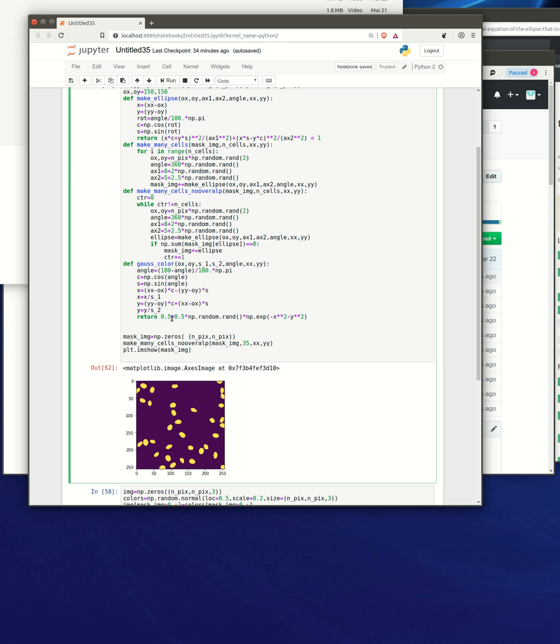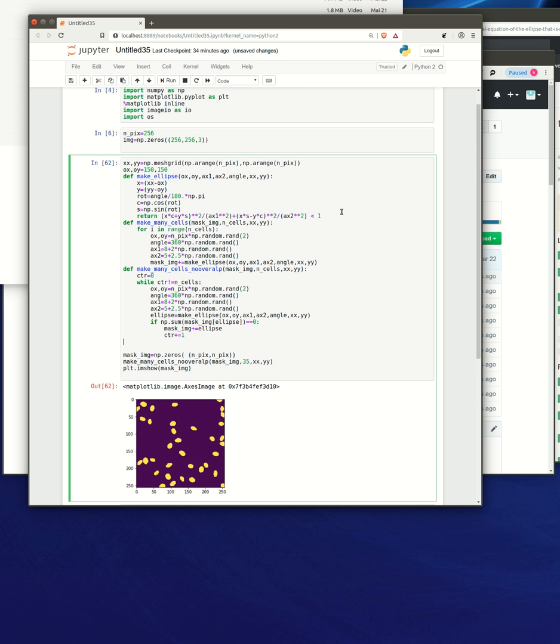So this can change to many numbers. Now the only important thing to think about is that at the end, because the background is all black, we also will have to add some noise to the background so that the network can reproduce the background from that noise of the real images. And we just want to have color levels so that we can separate the background from actual cells that are detected. So usually we put this number quite high with some variation, such that we can then separate it from the background in a later stage. So let's just tidy up. Let's put that definition on top.